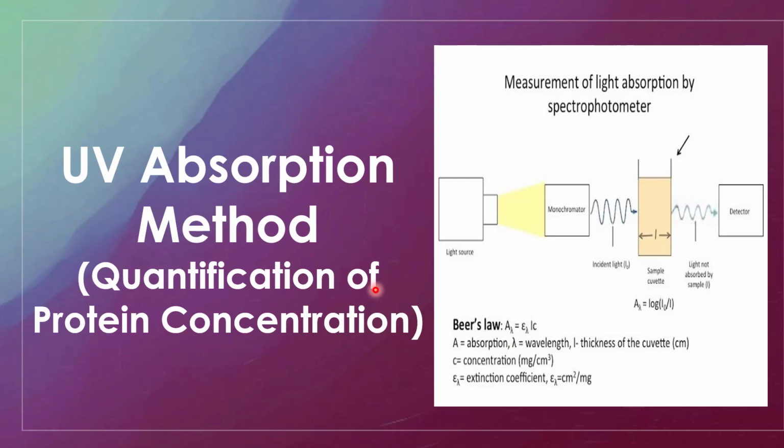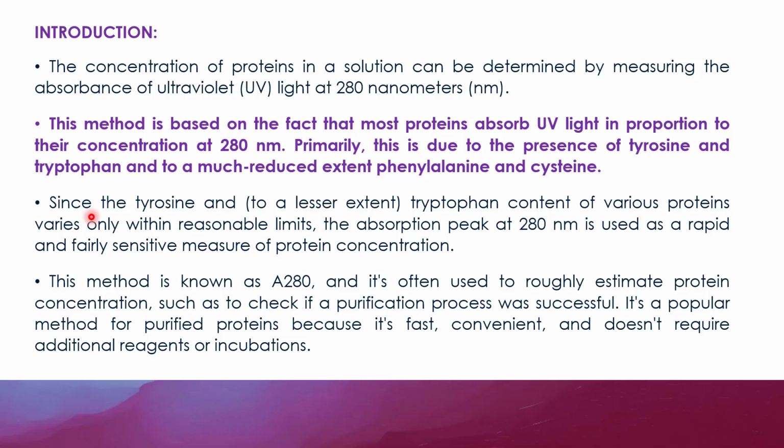In today's class and video, we are going to look at how to quantify protein concentration using the UV absorption method. We'll start our introduction by looking at why proteins absorb UV light at 280 nanometers.